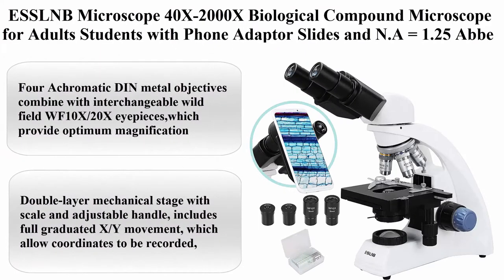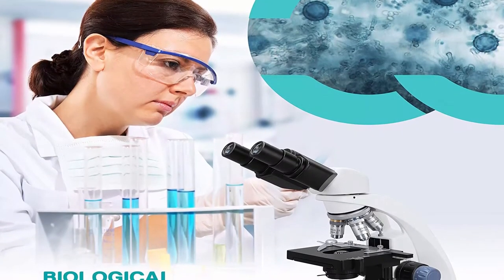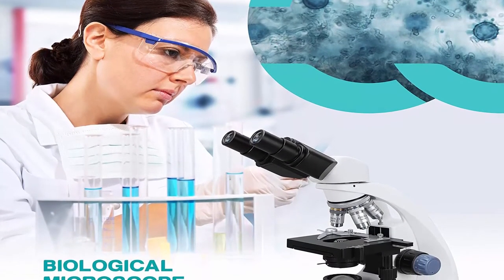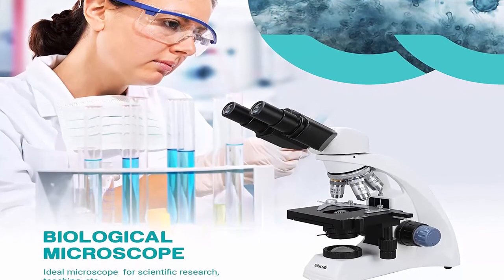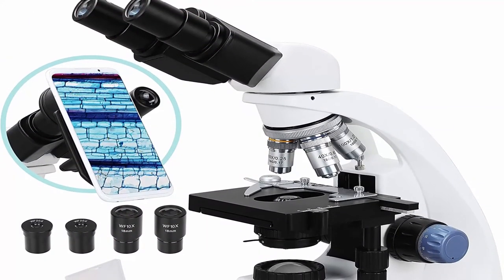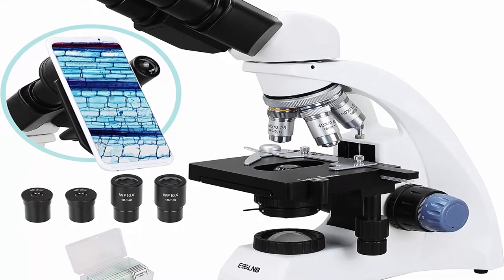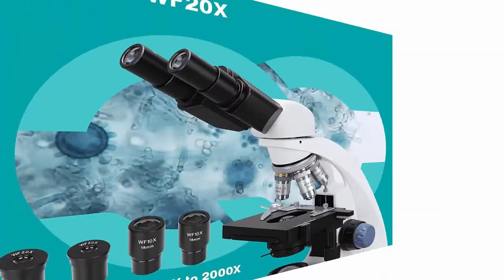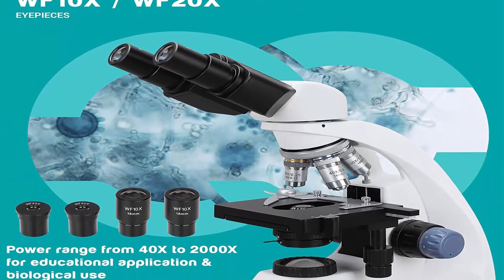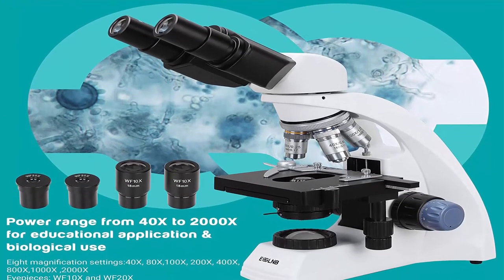Top 4: ESSLNB Microscope, 40x–2000x biological compound binocular microscope for adults and students, with phone adapter, slides, NA 1.25 Abbe condenser, LED, and XY mechanical stage. About this item: four achromatic DIN metal objectives combined with interchangeable wide-field WF10x–20x eyepieces provide optimum magnification of 40x–2000x for biological and educational applications. All microscope lenses are fully multi-coated, highly transparent optical glass for crystal-clear images.